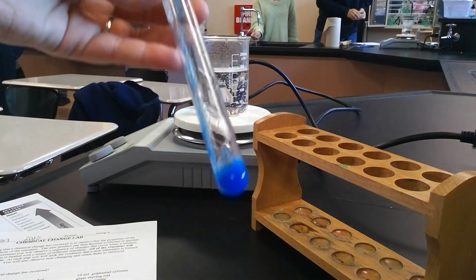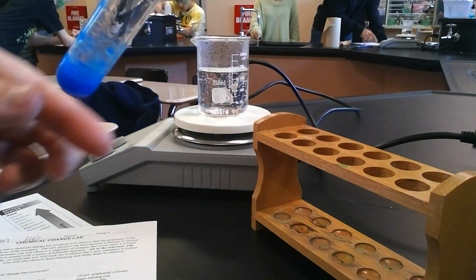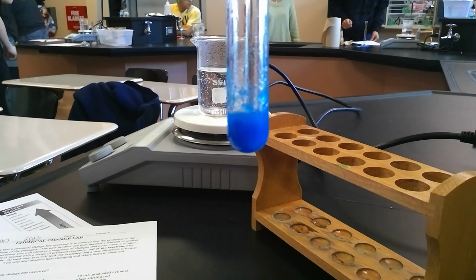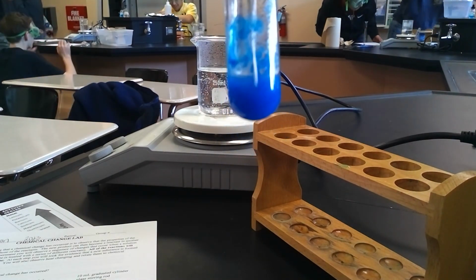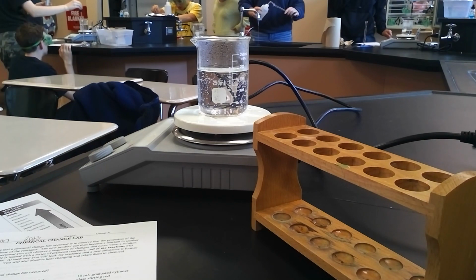They definitely look similar colors, but in person you can tell that this one is slightly darker. So that is what I would record for my observations here, and then as I swirl it around, you can tell that it's also getting chunky. So I'm just going to take my stir rod and mix this up so you can see the quality of that. So it's definitely chunky, clear, solid formed there.